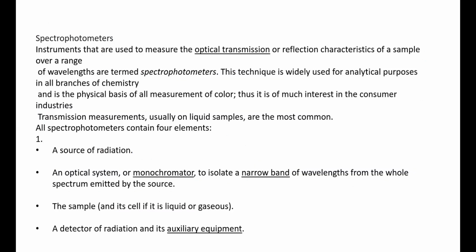Now, when I say spectrophotometers, it is based on the same principle, that is Beer-Lambert's law, how it works. We will go to the details of Beer-Lambert's law in the next lecture. Today's is just the introductory lecture on spectrophotometer. So when I say spectrophotometer, it is about the wavelength that you are going to use; instead of filters, a single wavelength can be selected.